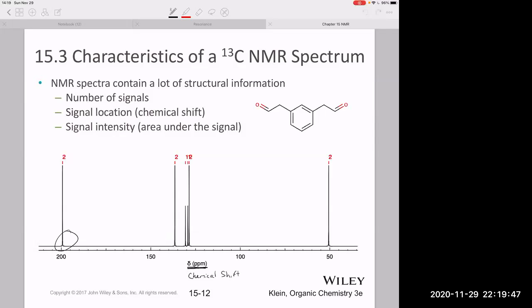You see we have these peaks here, right? So we have each one of these peaks, so we have 1, 2, 3, 4, 5, 6 distinct peaks here. And then also the information that's given up at the top are these numbers. These correspond to the integration of these peaks, and we'll talk about why that's important here in a second. But let me just point out that this peak here has an integration of 1 compared to this taller peak here, which has an integration of 2.